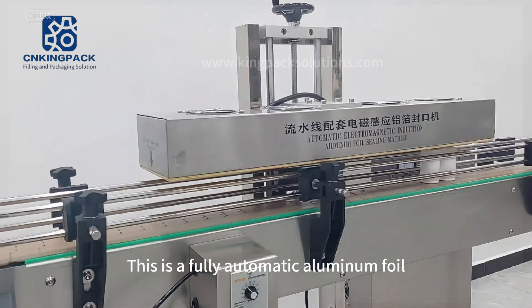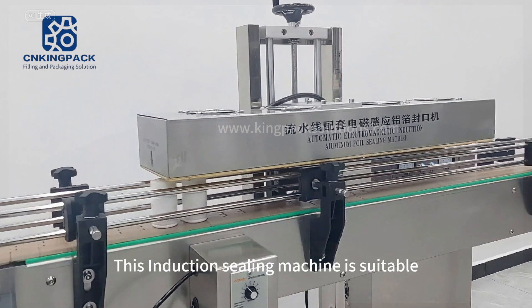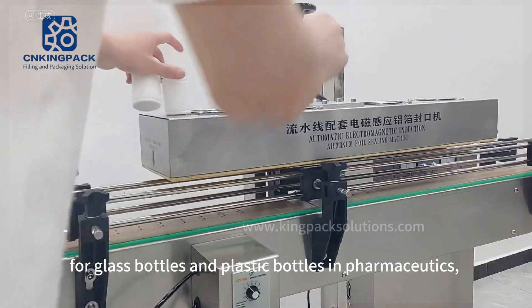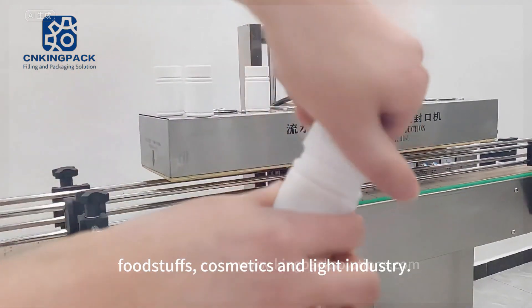This is a fully automatic aluminum foil electromagnetic induction sealing machine. This induction sealing machine is suitable for the sealing of flat cap with screw thread for glass bottles and plastic bottles in the pharmaceutical industry, pesticide, foodstuffs, cosmetics, and light industry.